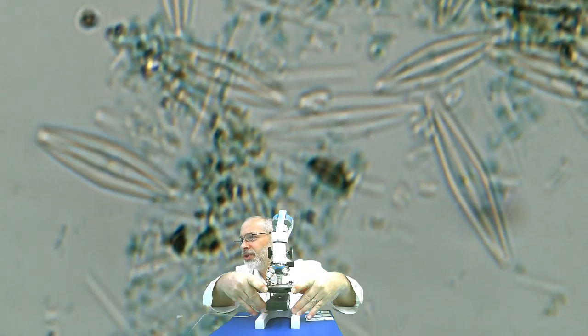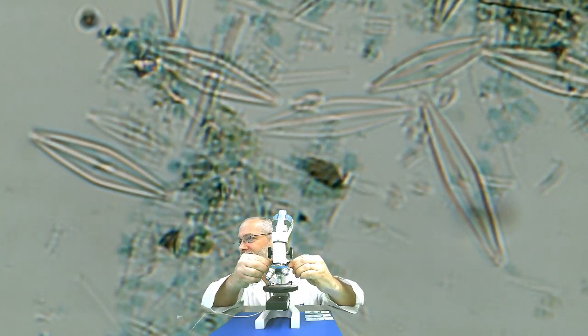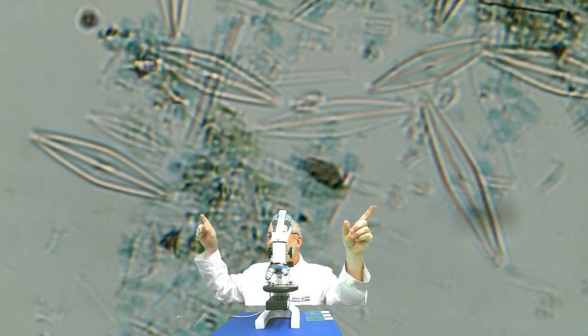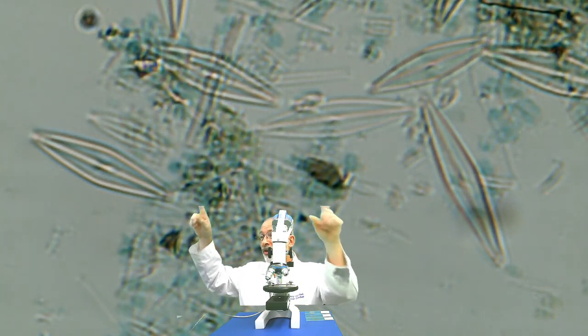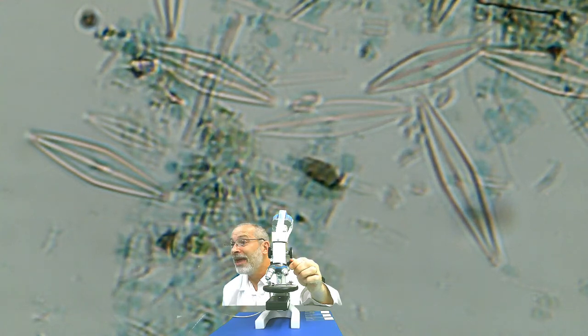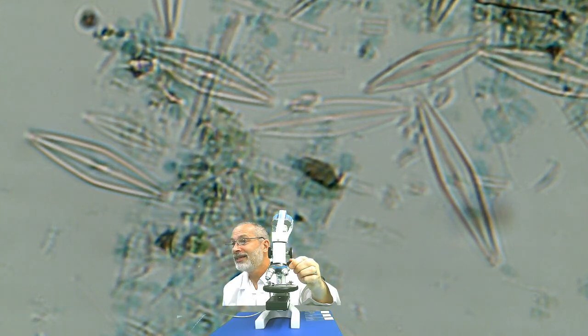Let's look at this variety of diatoms, and I'm specifically referring to the ones, not the smudge directly behind me, but the ones a little bit further out and over that look geometrically shaped. There are a number of them on this slide, basically made of 3 lines, but remember, they are 3-dimensional, and they are made up of a 2-part glassy shell. I just think they're fantastic to look at.